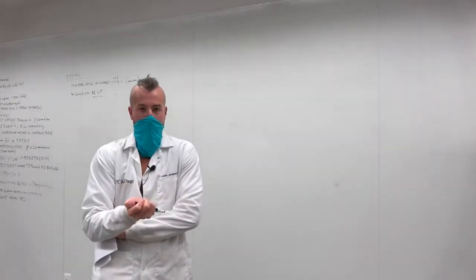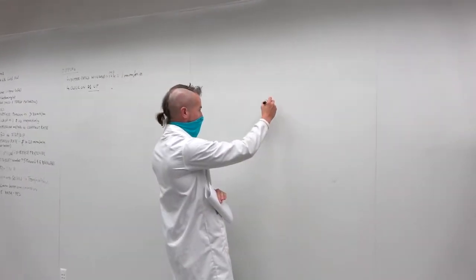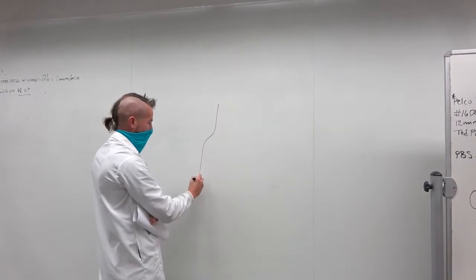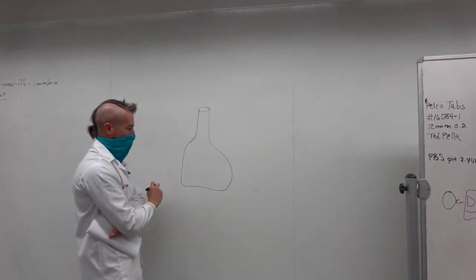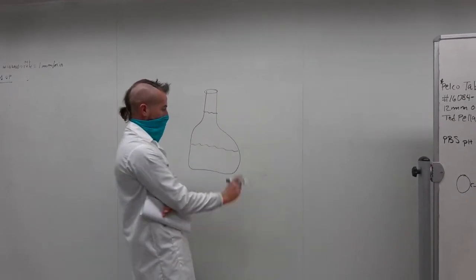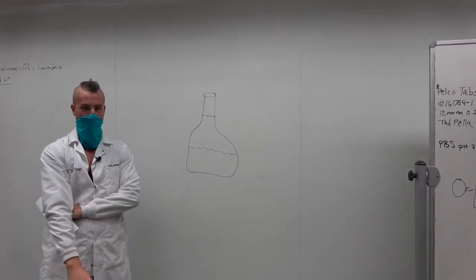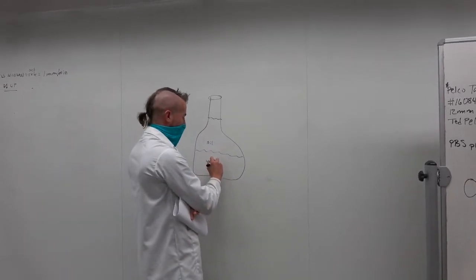That's a water and oil emulsion, right? Now, what happens to your salad dressing over time? It settles out into oil and water.